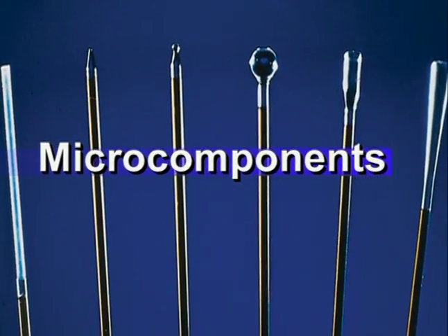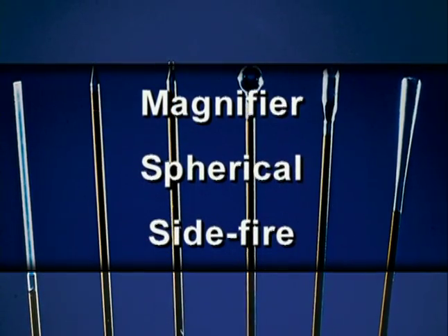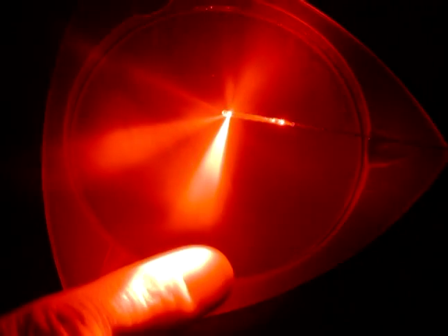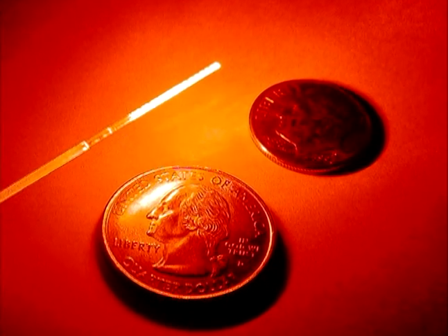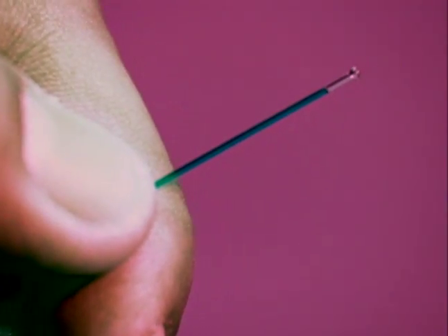Various sculpted fiber tip designs include taper, diffuser, cone, magnifier, spherical, side fire, and other combination designs custom made for specific applications. These tips are integrated into the fiber and formed using the glass material from the fiber itself. Through automated laser micromachining, we form these end shapes on fiber ends smaller than 2 millimeters in diameter.